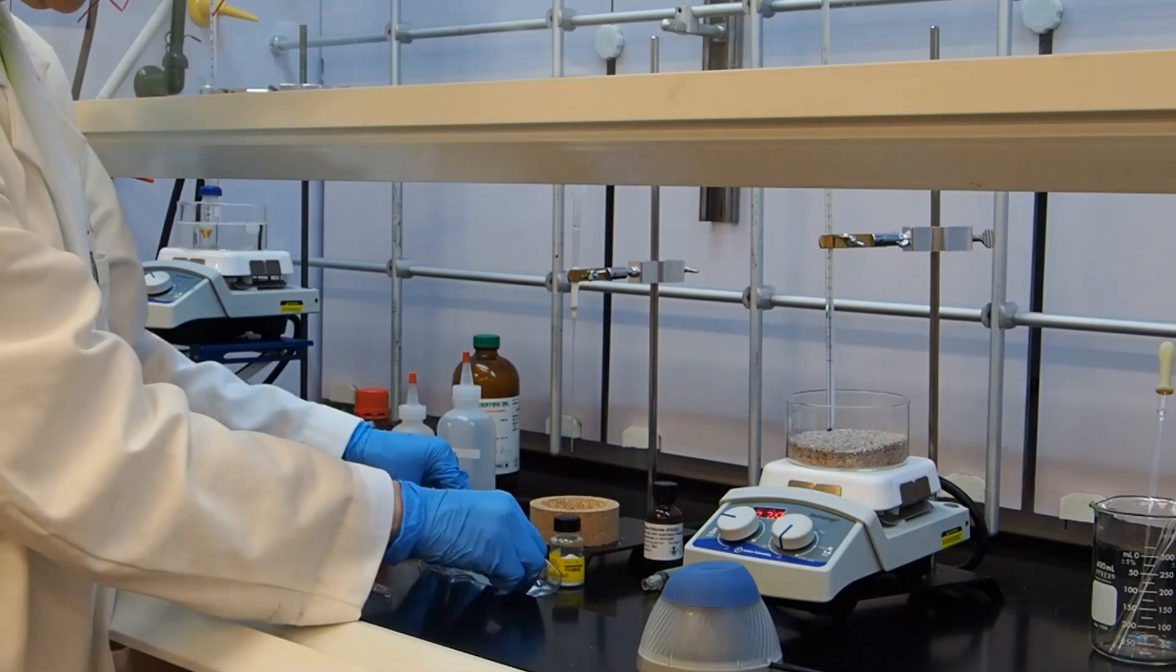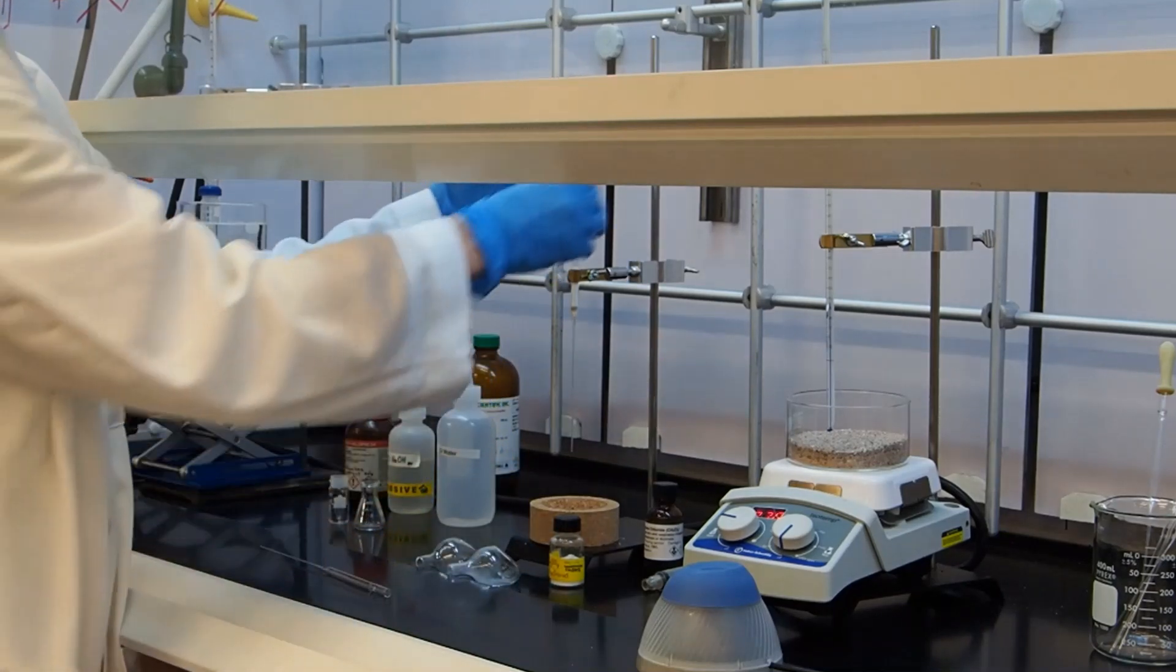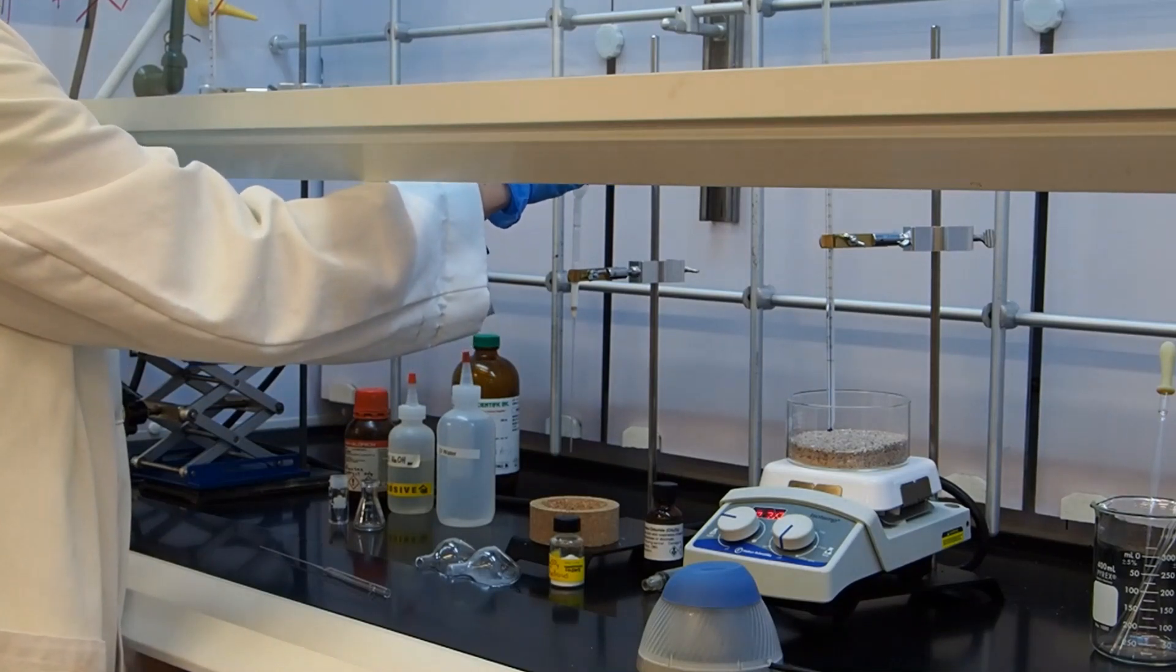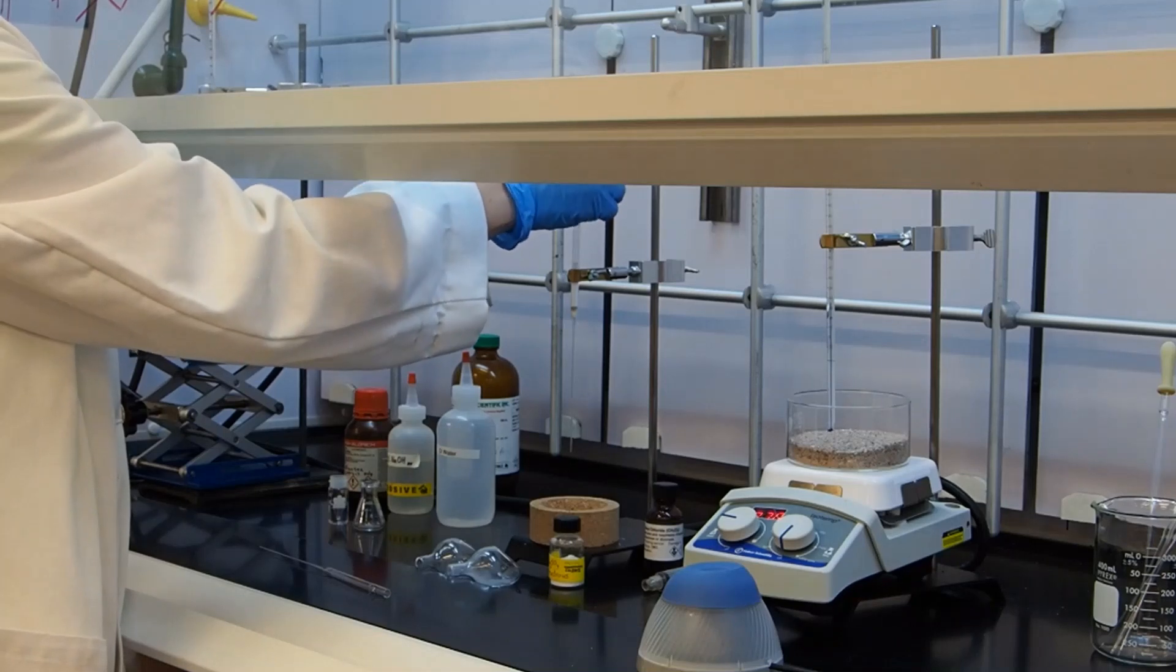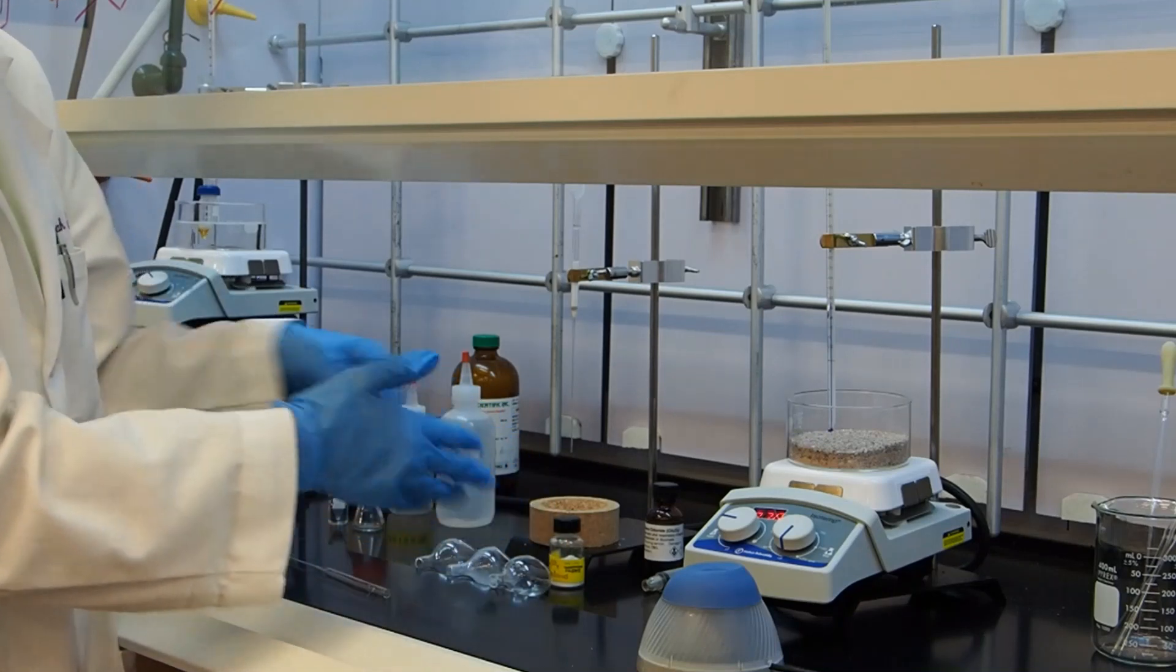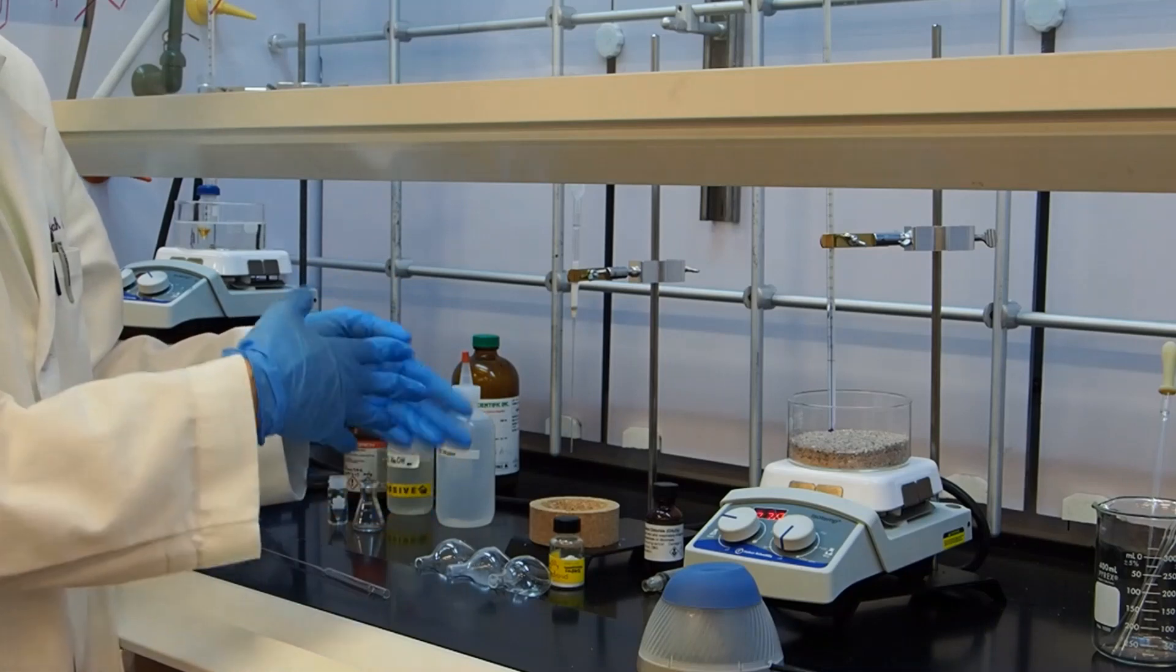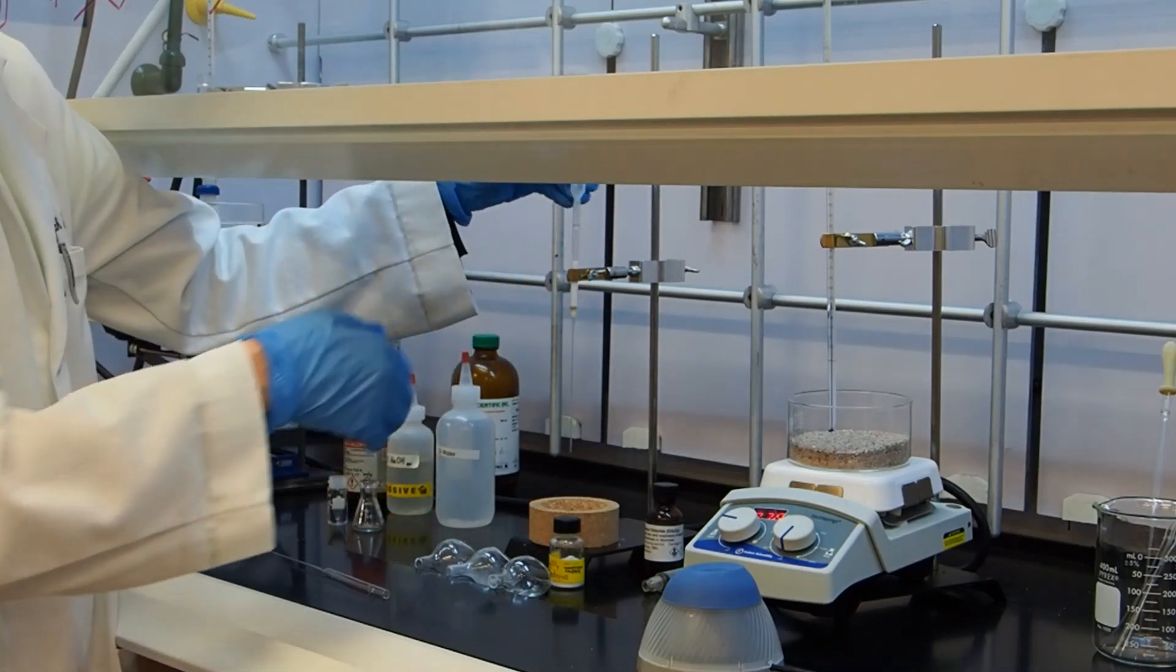The last thing to go on top is anhydrous sodium sulfate, about 50 milligrams. The purpose of this is to dry any of the solvent in the solution that we're pushing through the column. Normally you would add the sodium or magnesium sulfate separately and filter, so this is sort of a shortcut because we're doing this on such a small scale.